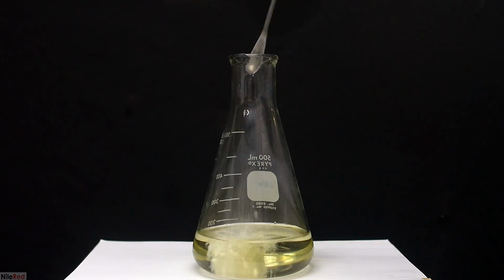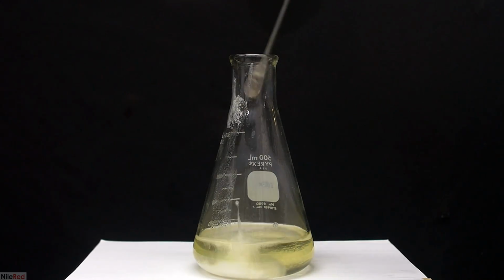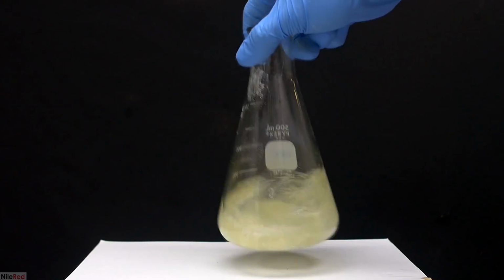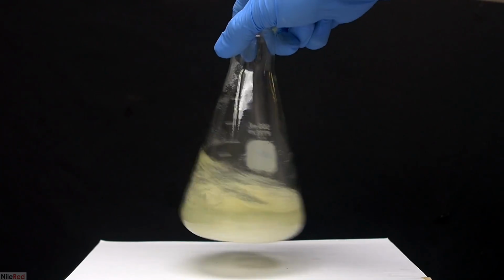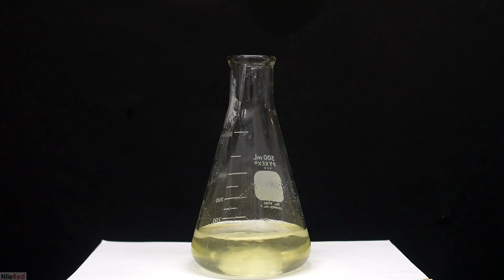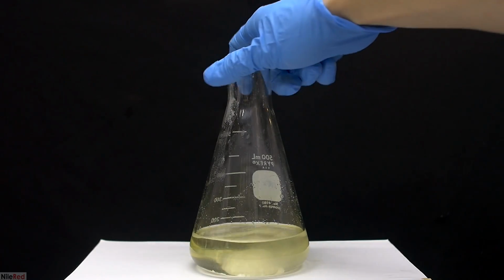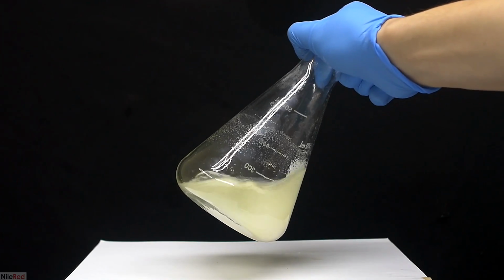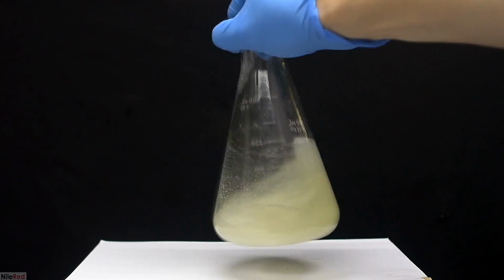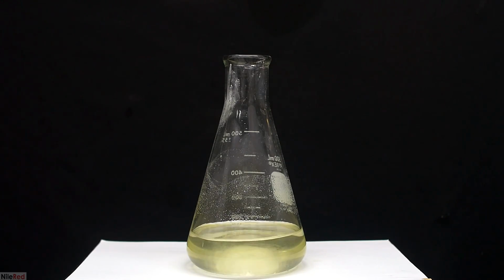The next thing that we need to do is dry our ether caproic acid mixture. Ether is generally not miscible with water, but it's still capable of dissolving a small amount of it. To dry things up, we need to use an appropriate drying agent, and in our case, I'm using anhydrous magnesium sulfate. If we were to skip this step and simply move on to evaporating off the ether, we'd actually be left with quite a bit of water in the product. I probably added way too much drying agent, so at this point, things should be relatively dry.